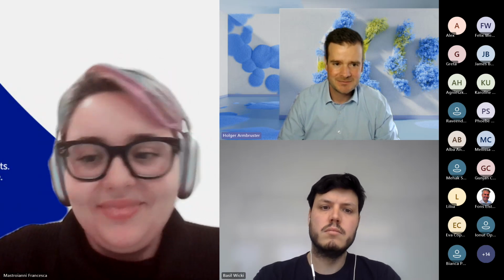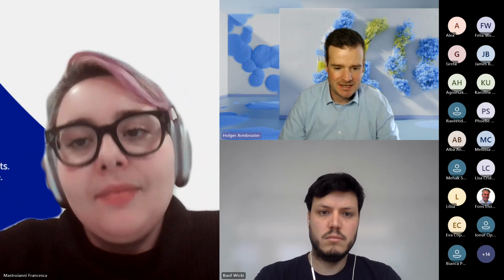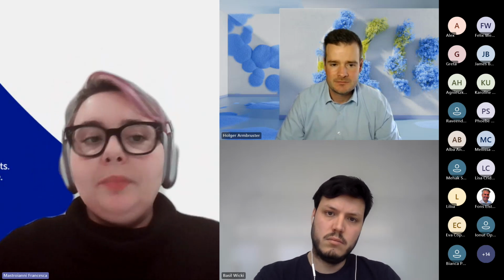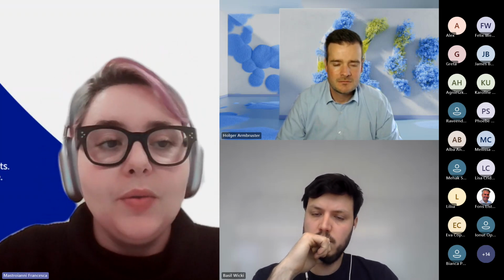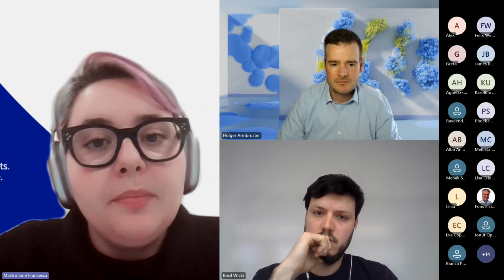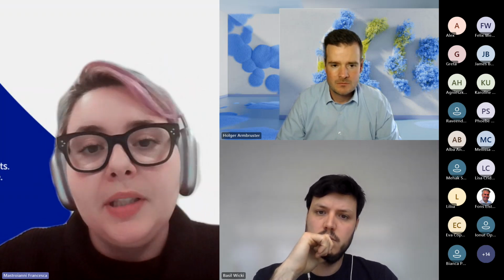Great. Thank you so much. And then we do have another question to you, Francesca, relating to cells. So Lisa is asking, hi, Francesca, did you try seeding cells with the I.DOT? No, we didn't, because we have another pipetting robot available in the lab. So for the seeding, we are using that, but it's something that we might explore in the future. It might also be useful to use just one instrument to seed the cells and then do the treatment.